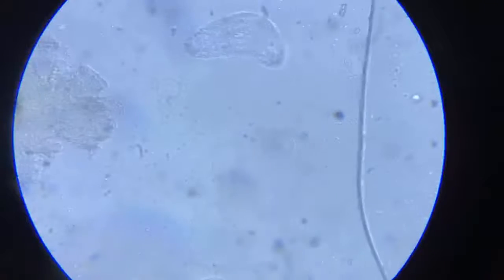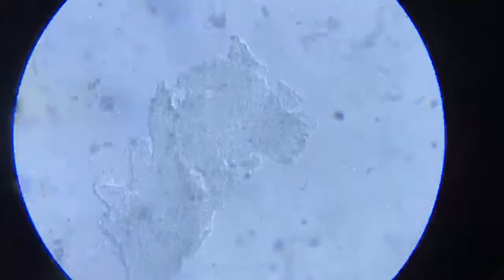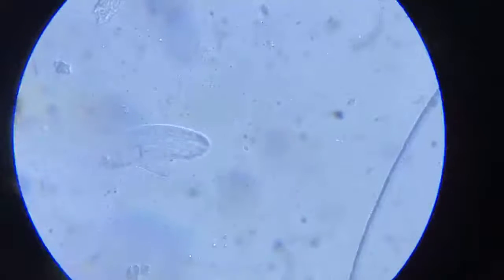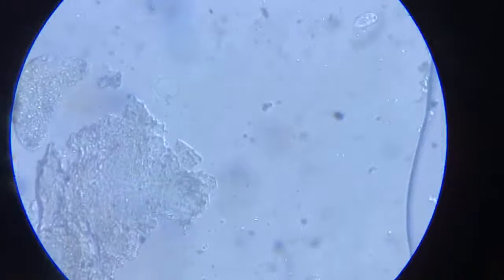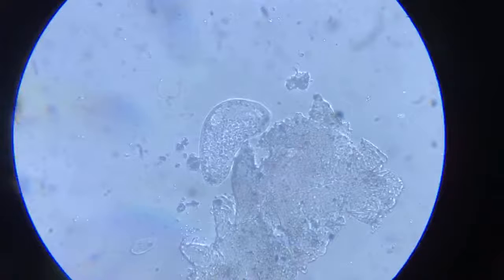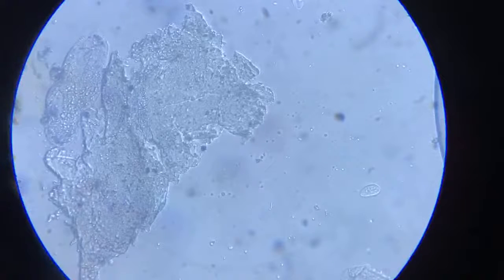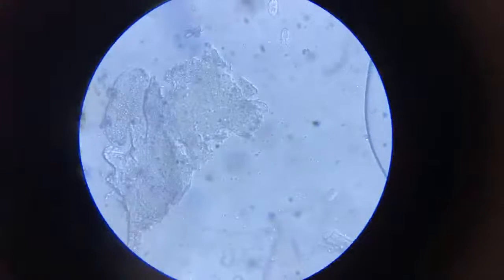Not much water is left on the slide now, and there is a big barrier nearby which will have the ability of deflecting this water film, further making it fragmentized. Let's watch this water film.